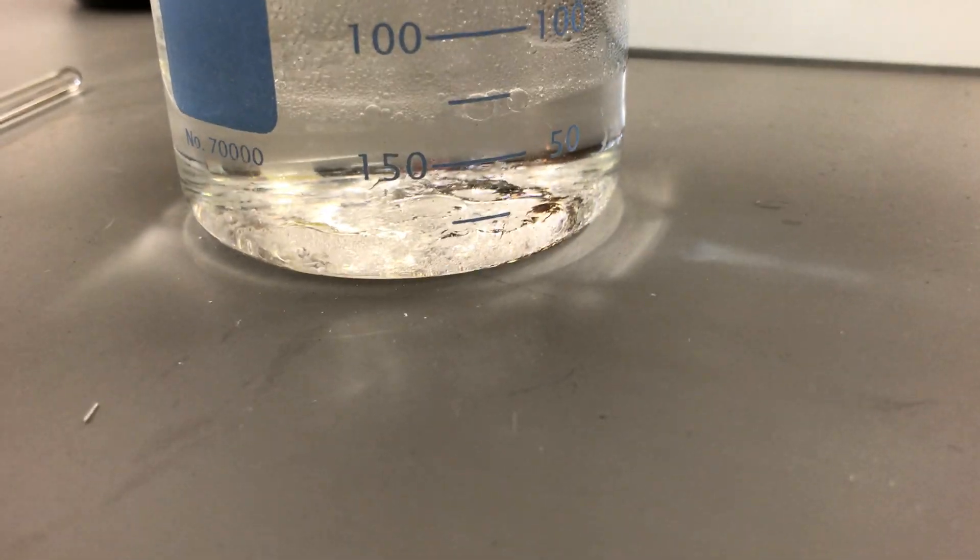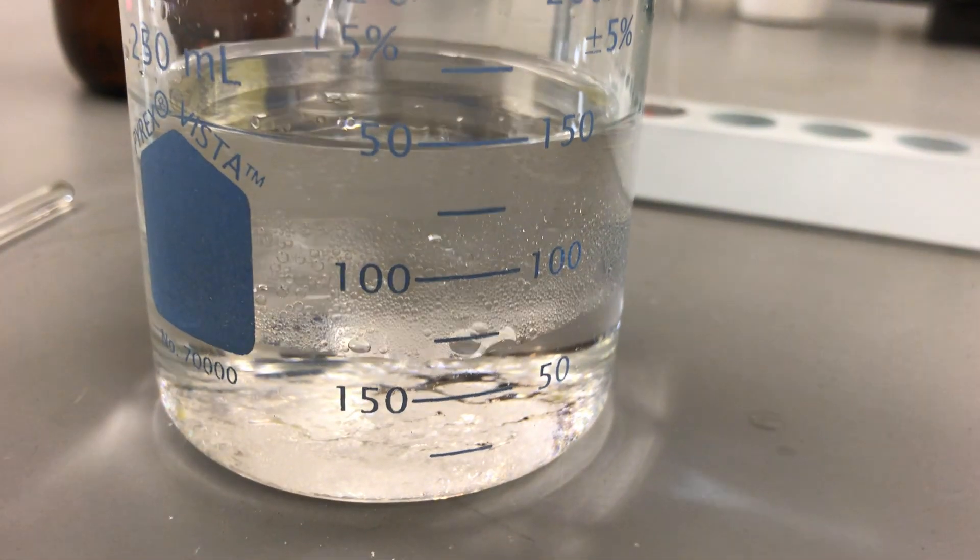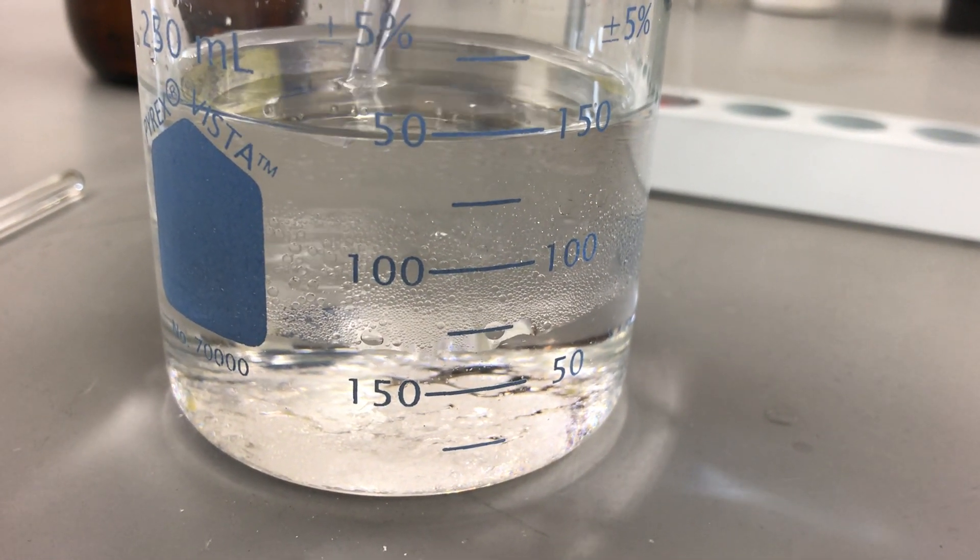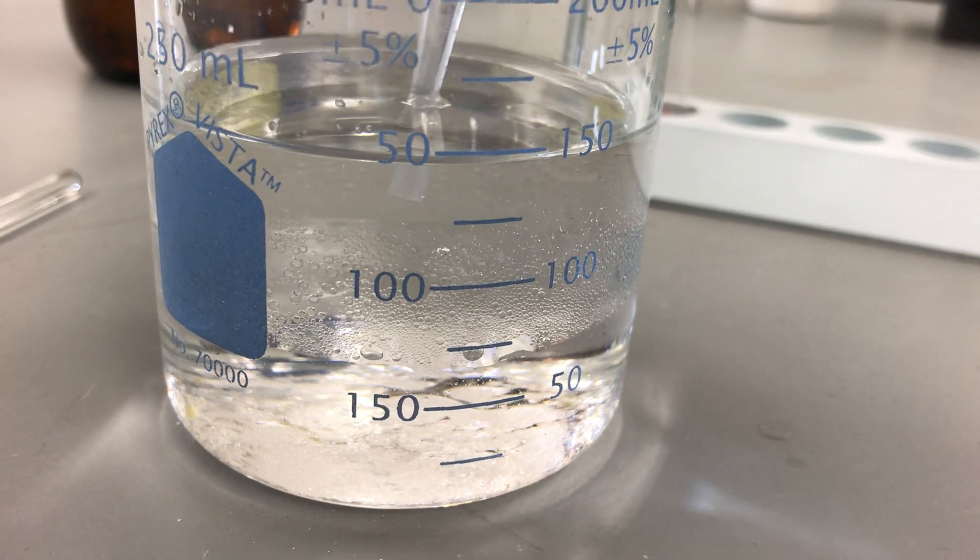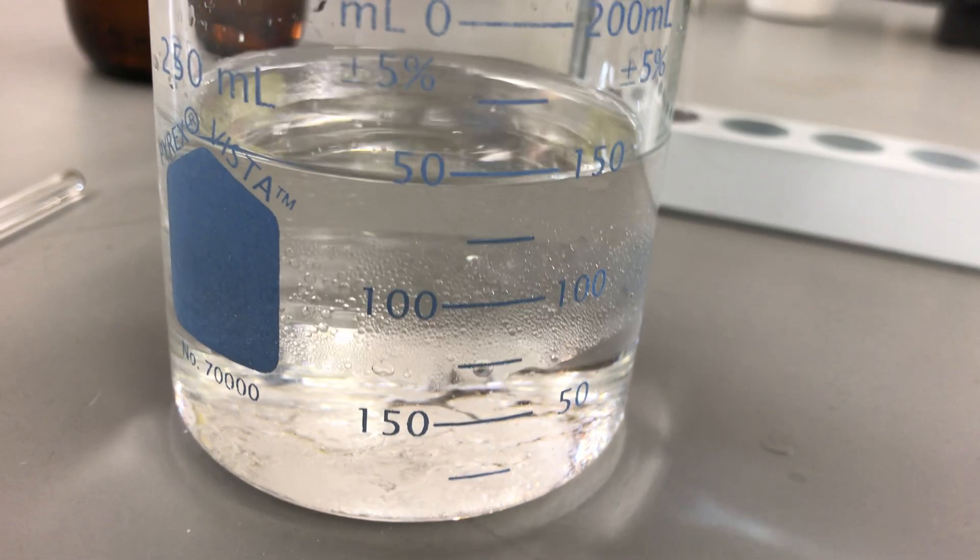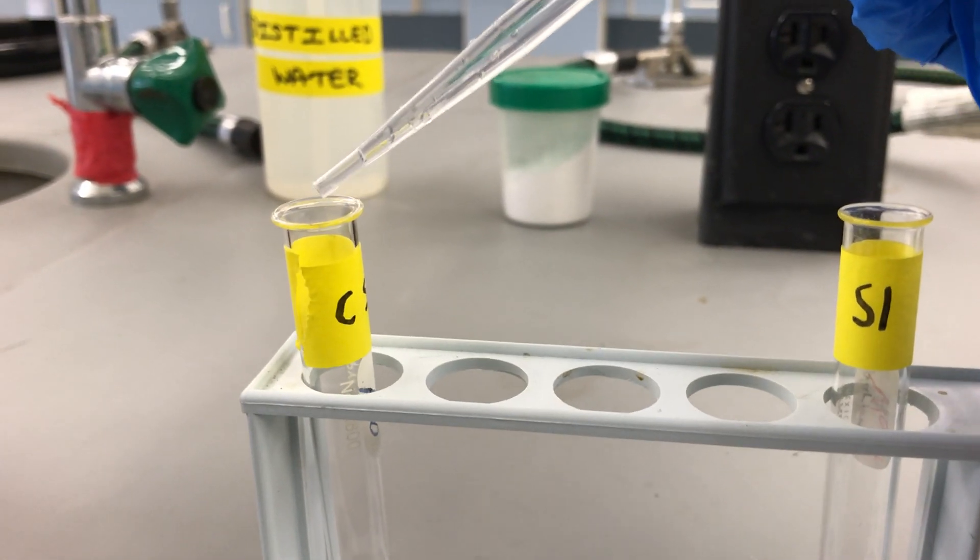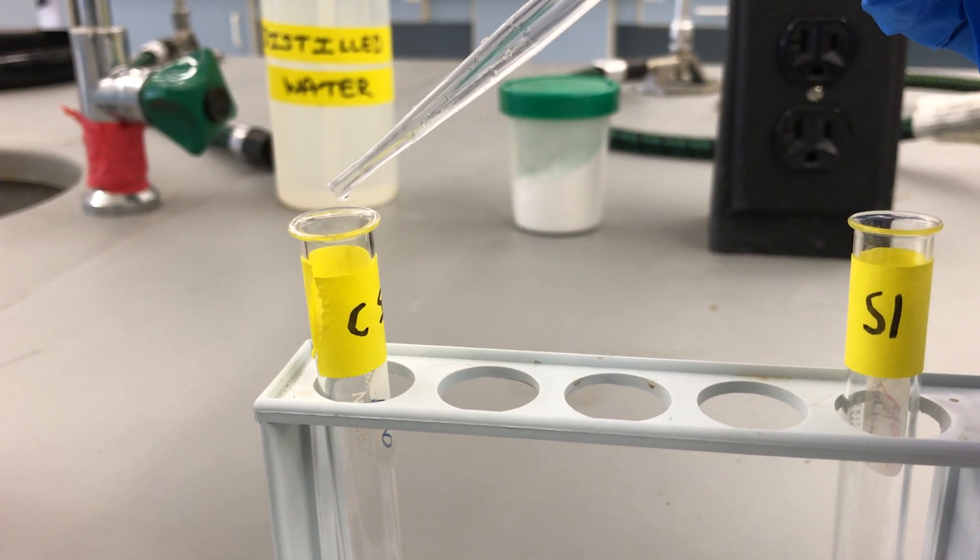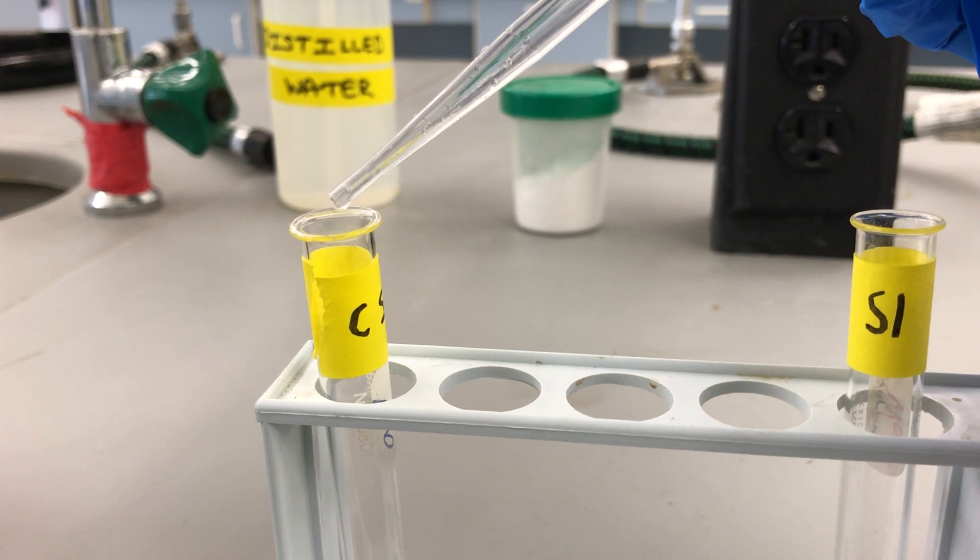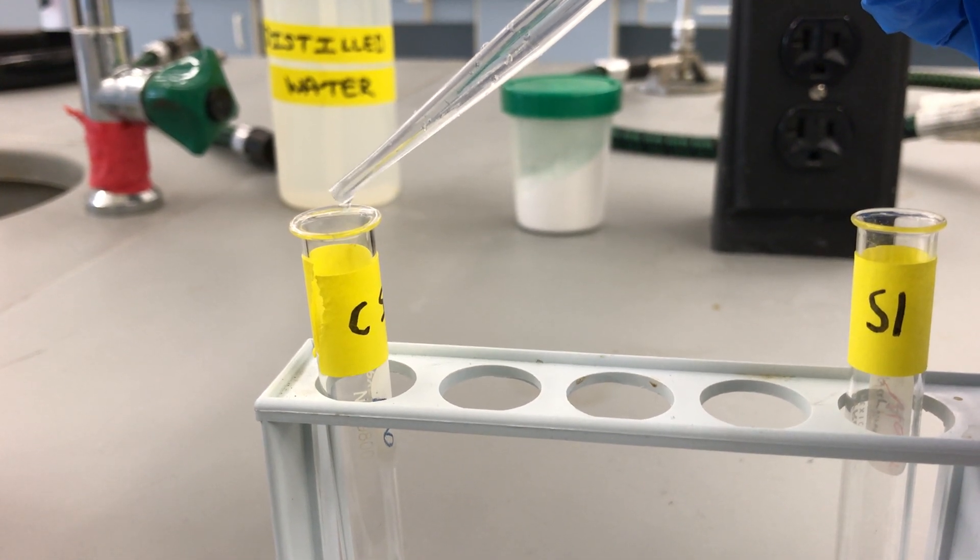So, once again, squeeze the bulb of your pipette, insert it into the upper layer, and suck some of it up. And, once again, about seven drops into each test tube. So, one, two, three, four, five, six, seven.